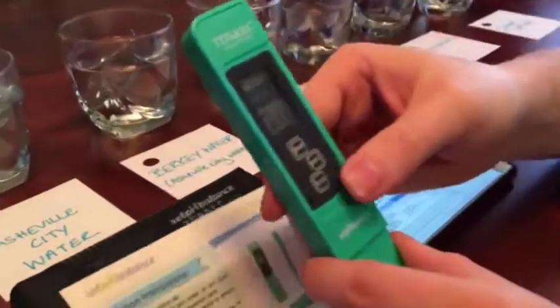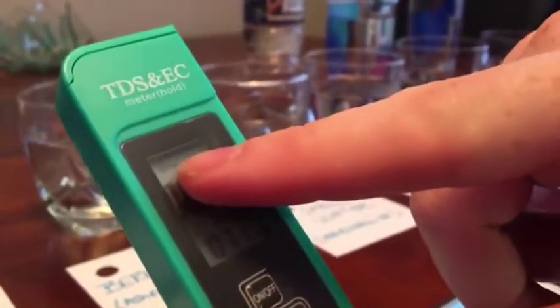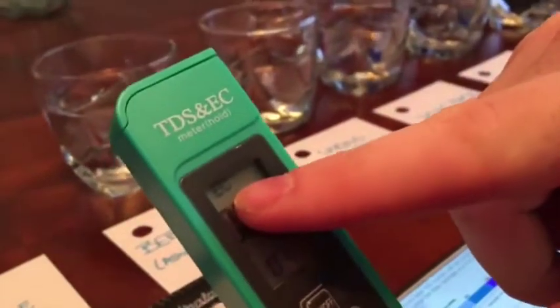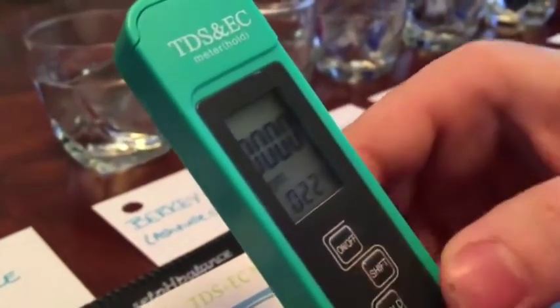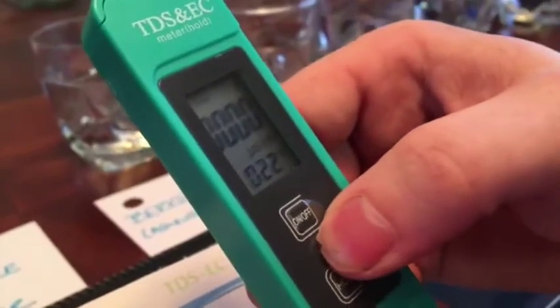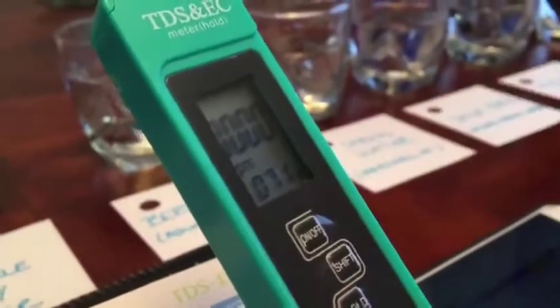That's nice. So we can hit the shift button here, and we can change to right here for EC. That's measuring the amount of salt, the conductivity, and we can push the shift button again, and we're back to ppm. But now we are in Celsius. So shift again, conductivity, Celsius, push it again. Now we're back to total dissolved solids, Fahrenheit.